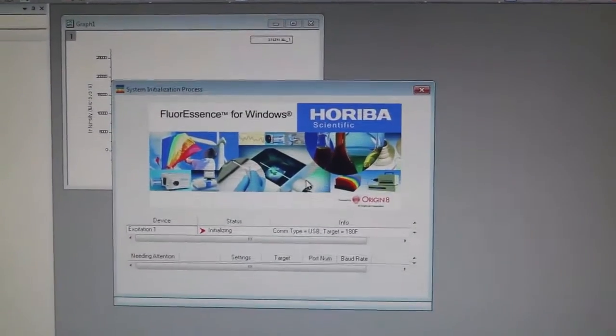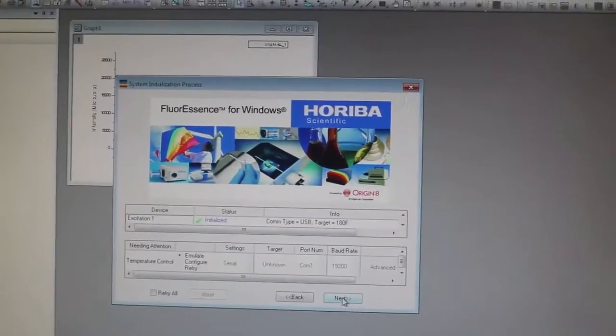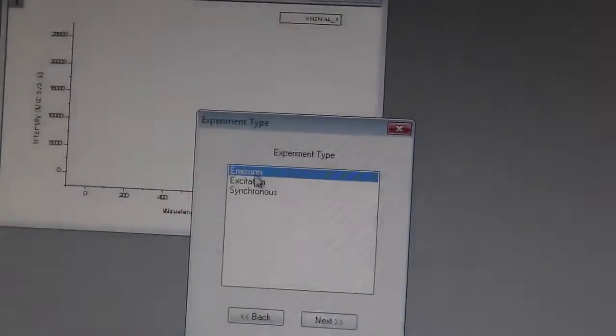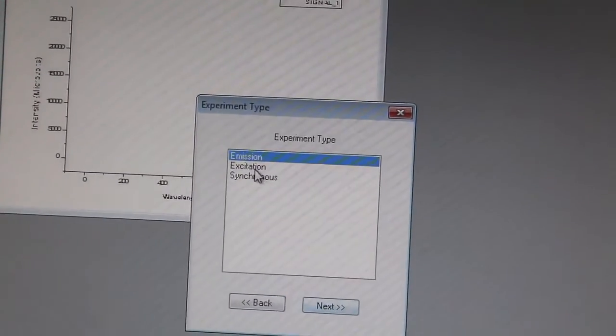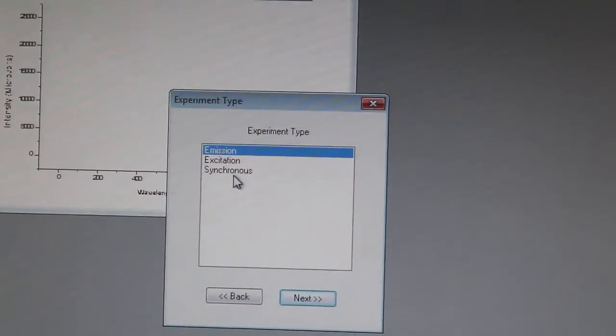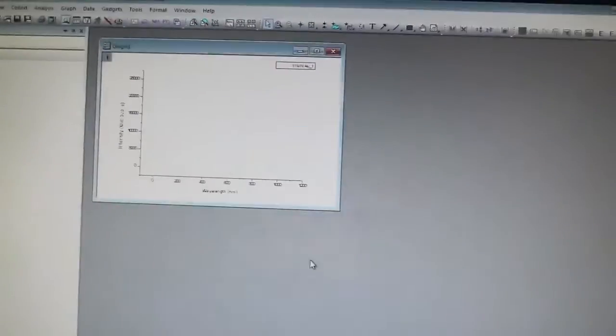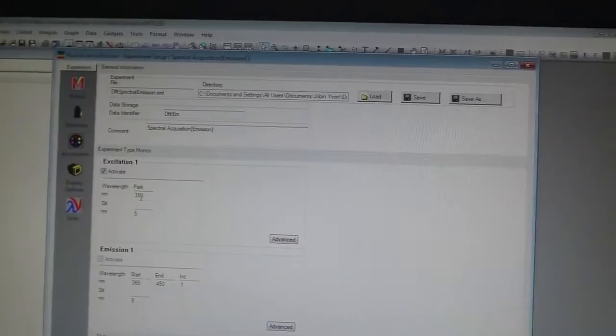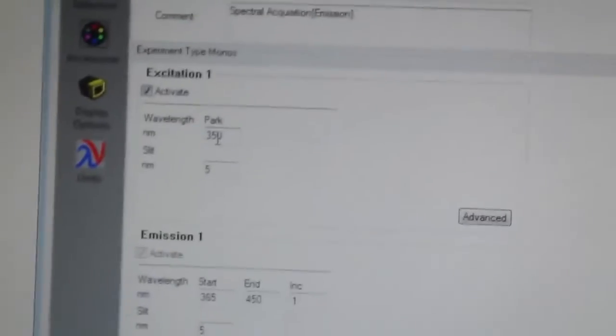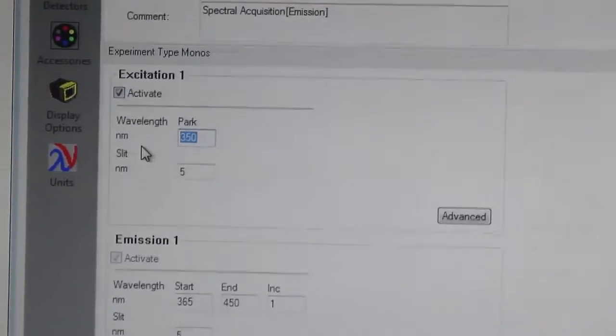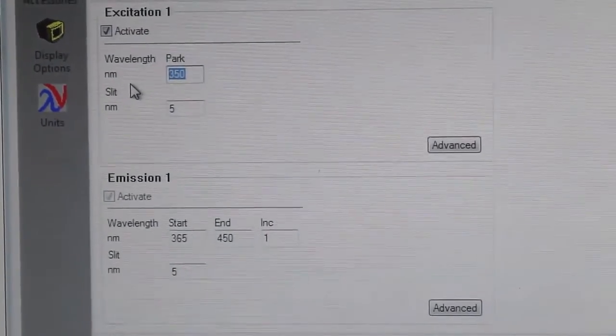In the FluoroEssence v3.5 software, click on this button which opens the experiment menu, then click next. Clicking on emission spectra—we can have excitation spectra or both synchronized, but for this experiment we will collect emission spectra. Our sample has Alexa Fluor 488 attached to one DNA and Texas Red on another.